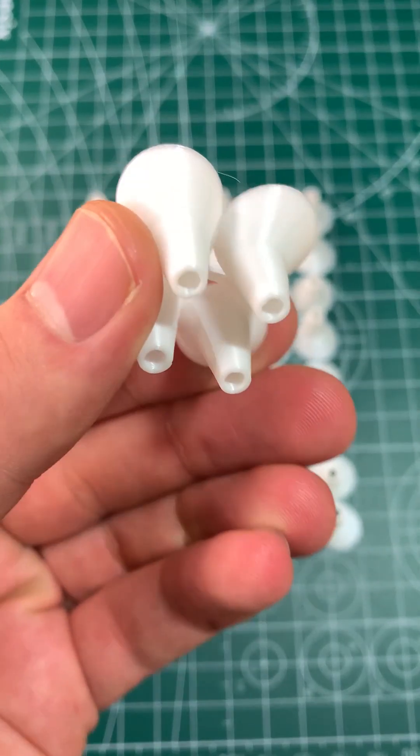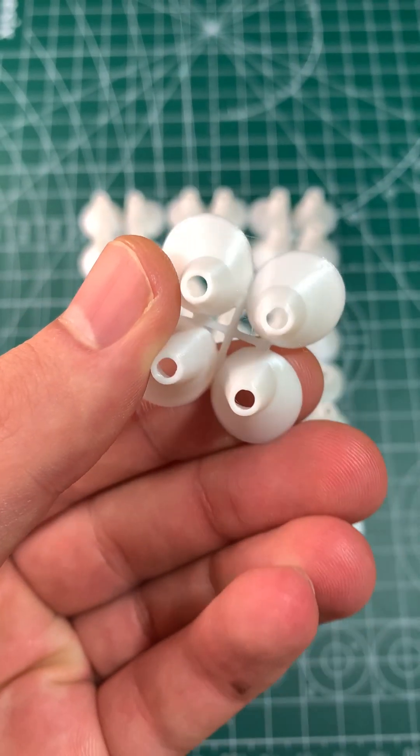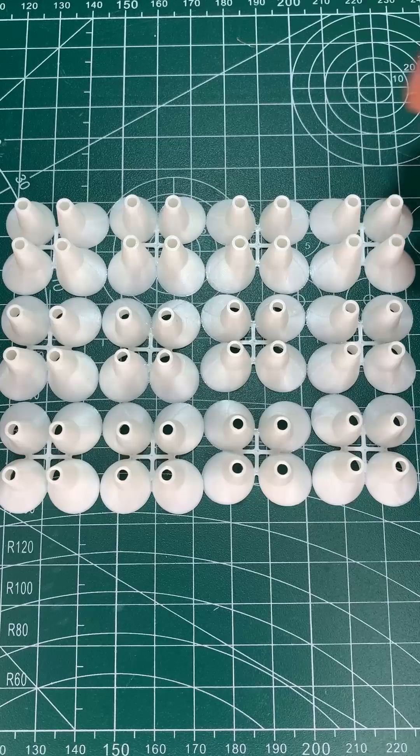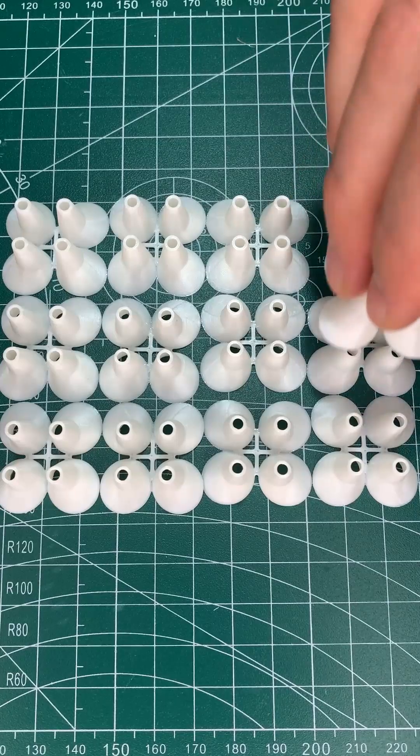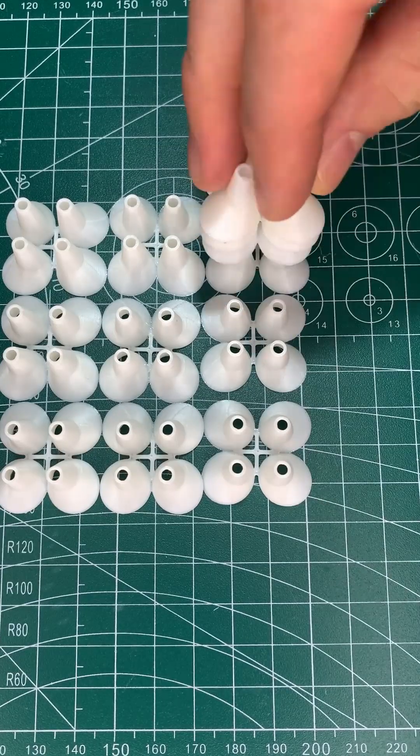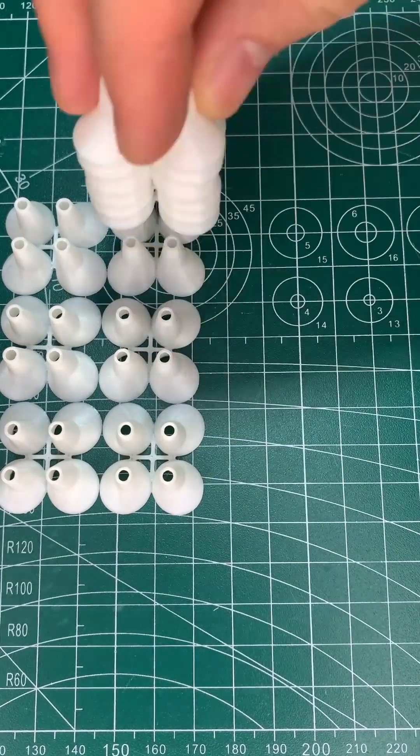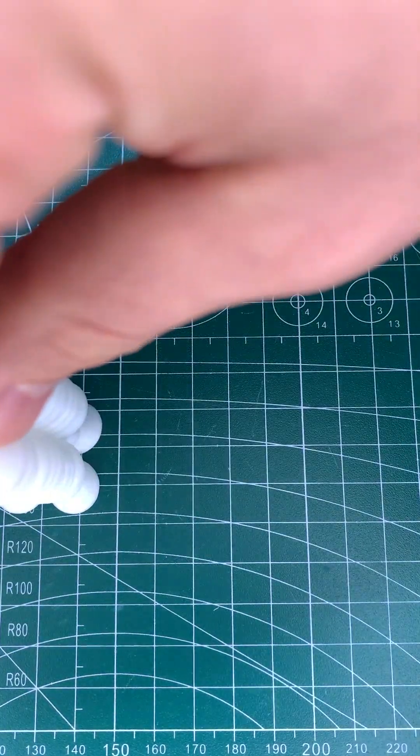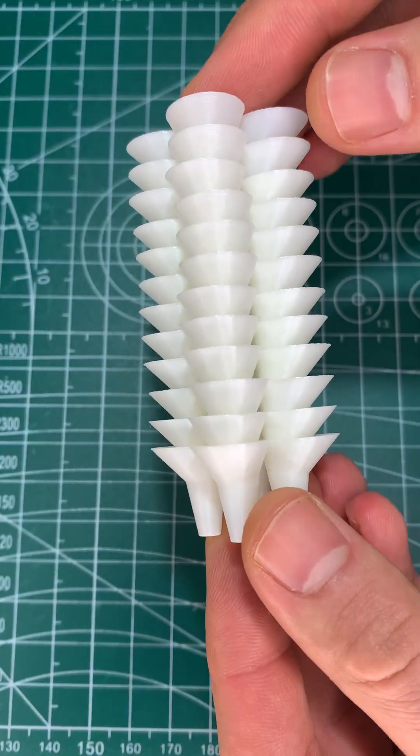Each cone can hold up to 400 microliters of growth media, which means the cells living in the chip can survive quite a long time. The best thing is they can be cleaned and reused.